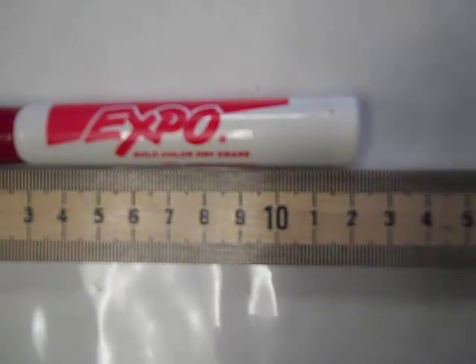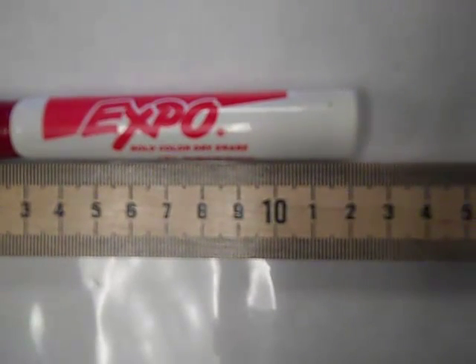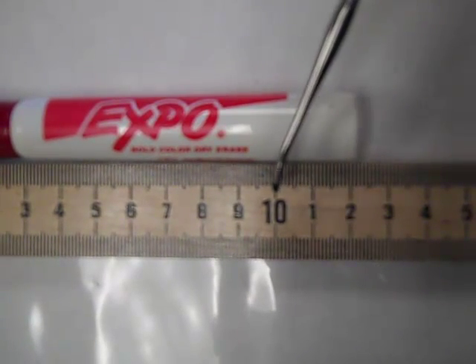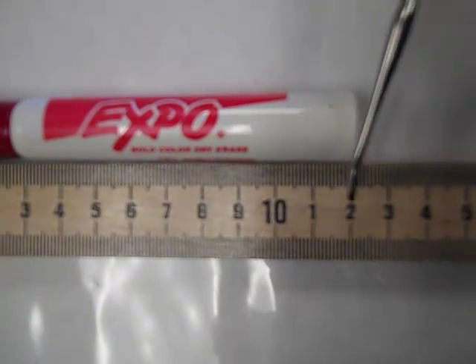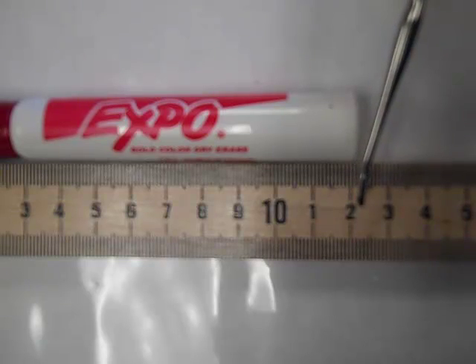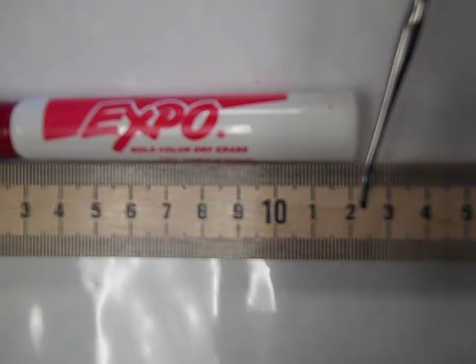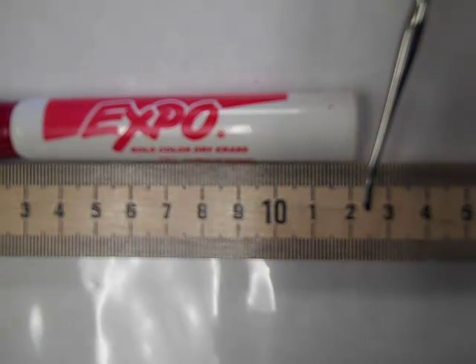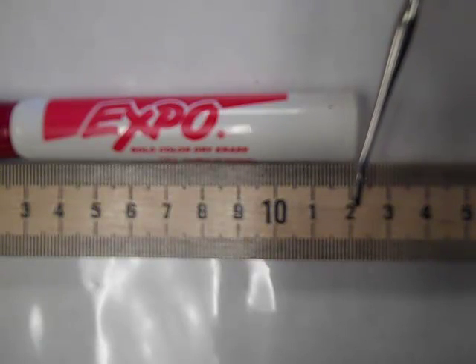Go to the end, and look that it goes to about the 10, 11, 12. Once again, that's centimeters, 12 centimeters long.